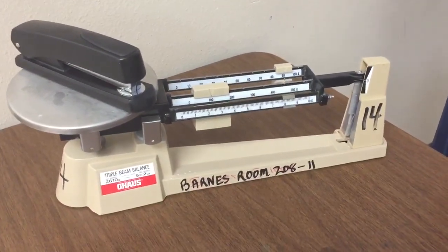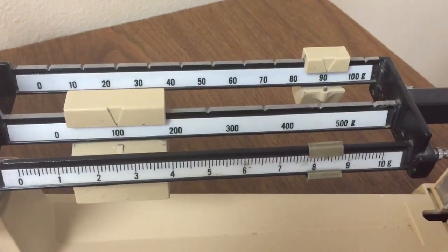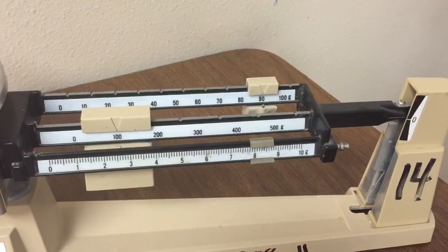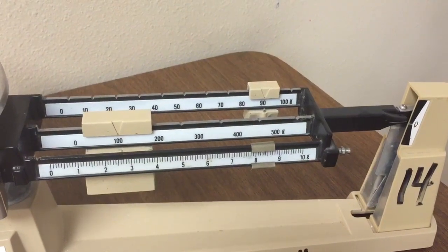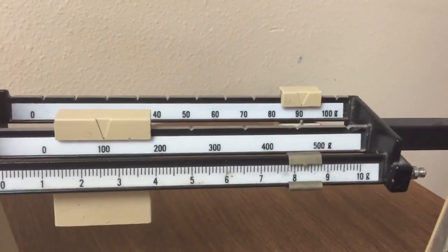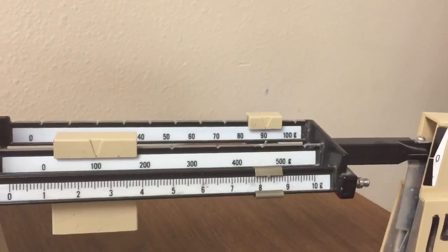Now we're going to measure a stapler. I want you to measure this on your own and read the triple beam balance. Don't forget to start with the hundreds, then move to the tens, and then to the ones. And make sure that you focus on the tenths. While you're reading this, if you need to pause the video, please do so.